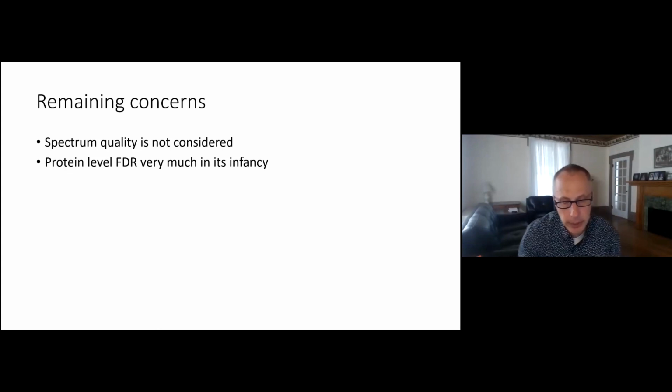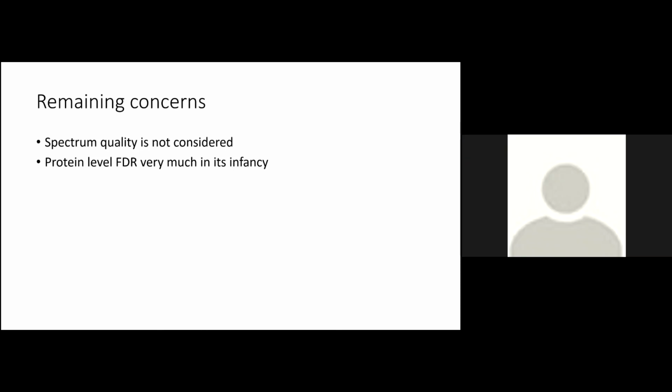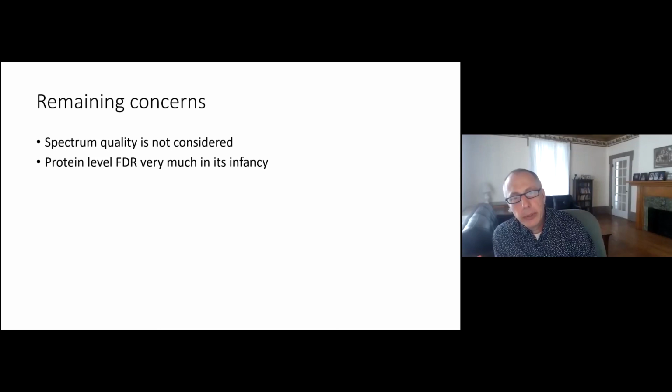I don't always group things by the gene. I just let them fall out of the inference algorithm, and you understand our inference algorithm based on previous discussions. And so a proteoform thing is a totally different thing because we're not really doing protein grouping so much. We're really focusing more on proteoform identifications than proteoform group identifications. And so that's kind of a separate discussion.